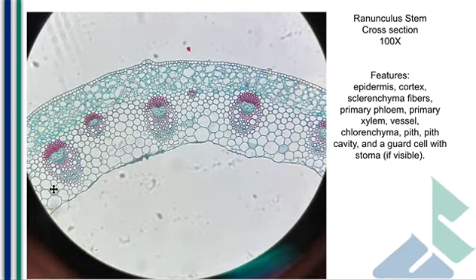But just like before, we do see similar features. We see a very distinct epidermis. You even see a stomata here in this slide. So yes, stomata can, or rather epidermal tissue can still have that stomata, a little bit of breathability. We see the cortex, the layer above, if we're talking about concentric rings, above the vascular bundles, where there's going to be photosynthesis happening. And then we see these support tissues for our vascular bundles.